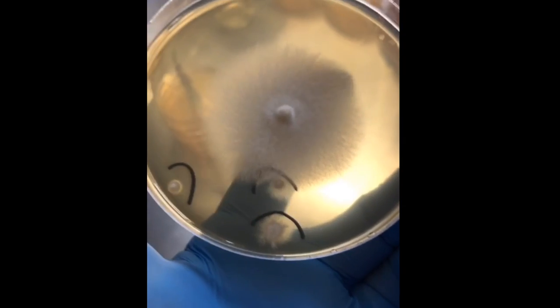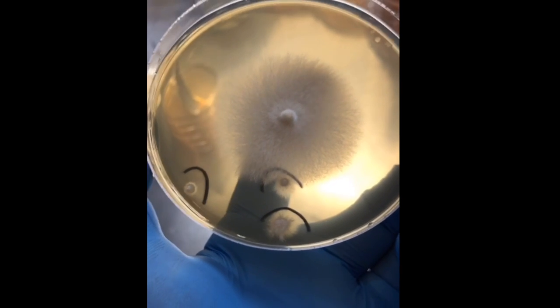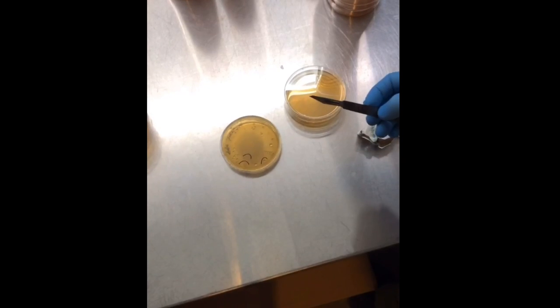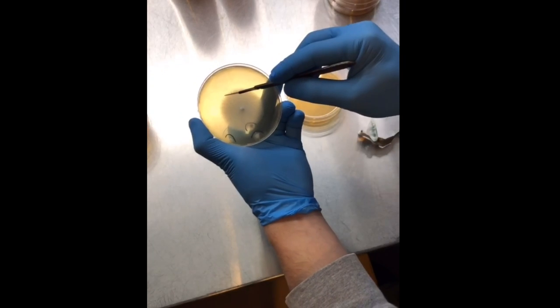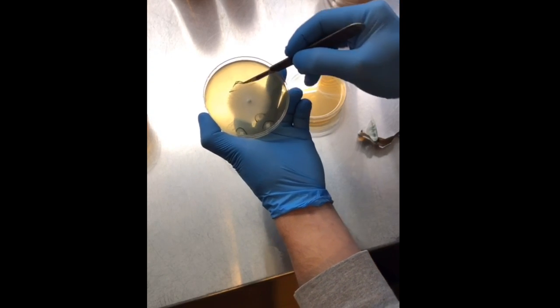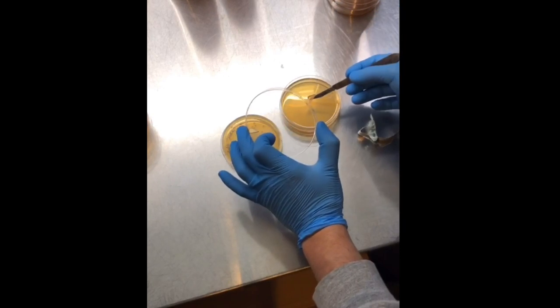The cleanest part of the mycelium is going to be along the edge farthest away from the contamination. The mycelium will outgrow any bacteria or molds, so that's where we're going to take our culture. Use a sterile scalpel blade to cut the edge of the mycelium and transfer to a fresh agar plate.